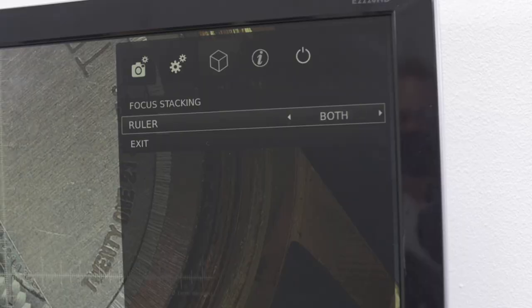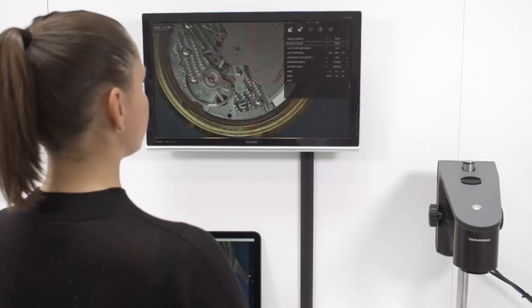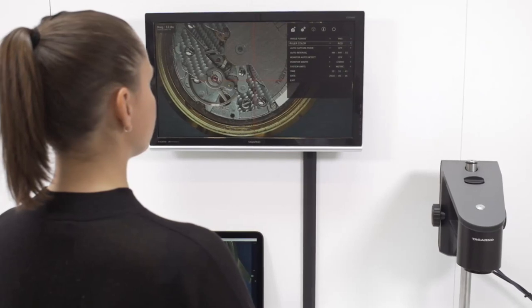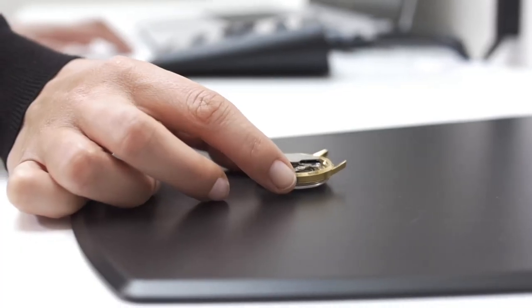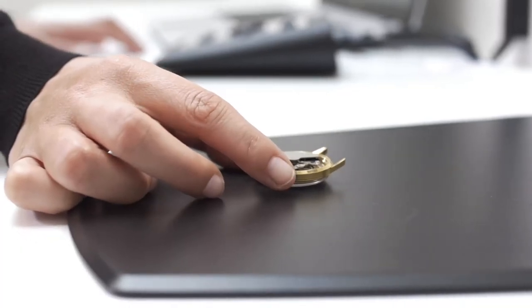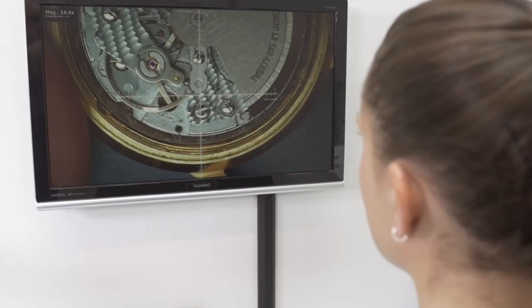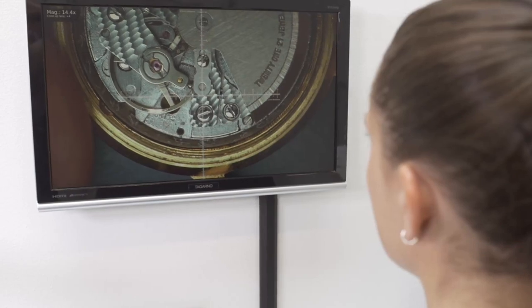The ruler function allows me to do precise on-screen measurements and also create documentation by saving images with graphics afterwards.